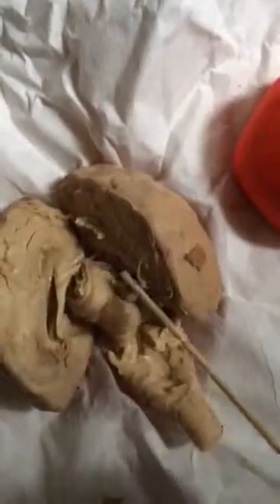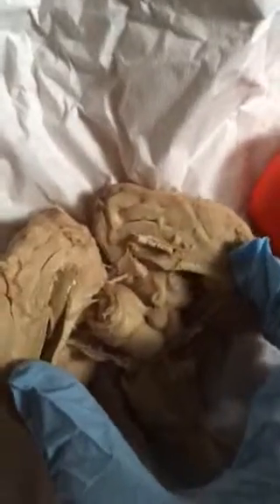Sheep's brain, here's the pineal gland right here, and just pull away some of the interior. Hypothalamus would need to be in this region, somewhere in here in the middle brain. It's definitely more difficult to see the features of an actual brain than a clay model. But those are the features of the brain.